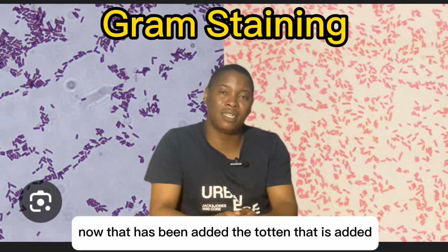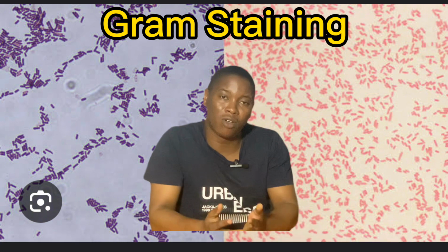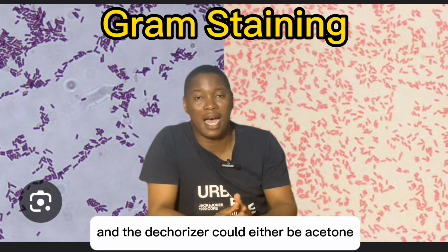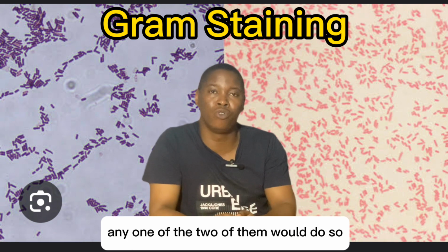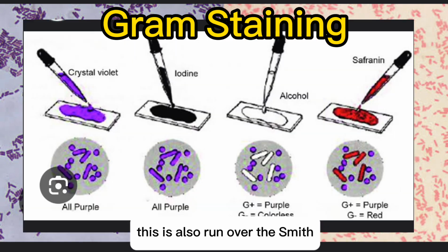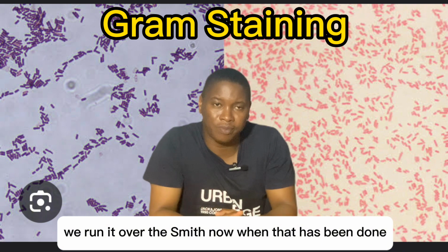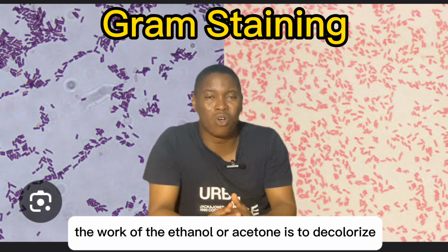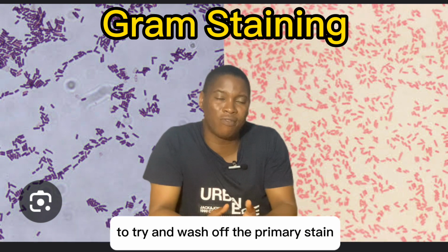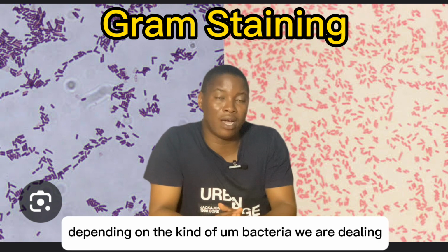After that, the third thing added is what we call the decolorizer. The decolorizer could be either acetone or ethanol, any one of the two will do. It is run over the smear, and we try to run it very well. The work of the ethanol or acetone is to decolorize, to try and wash off the primary stain, depending on the kind of bacteria we are dealing with.